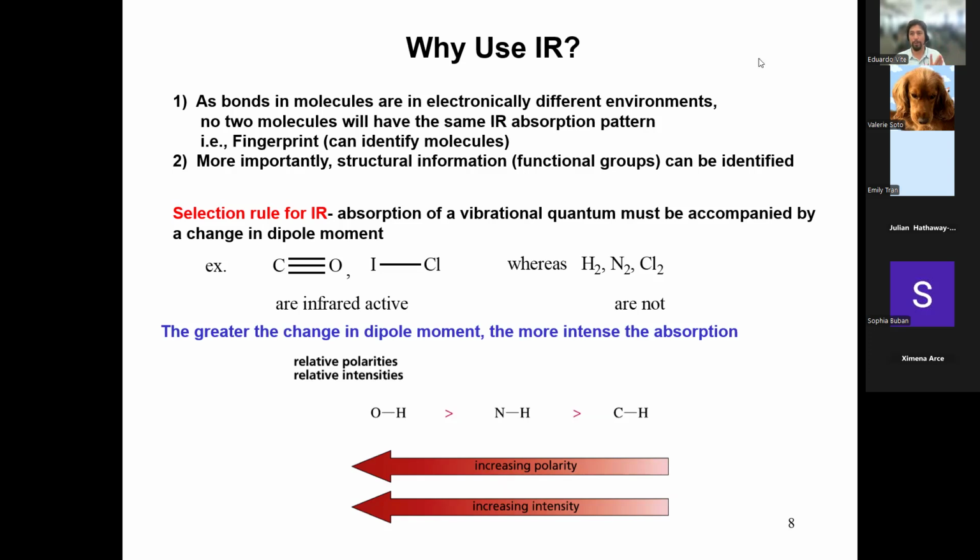And you've got to be careful because remember, IR depends on a change in the dipole. The polarity has to change when the bond is vibrating. If the bond vibrates but there is no change in polarity, for example, we learned about the diatomics in 111A and 111B: H2, N2, O2, F2, Br2, I2. Think about it. You have hydrogen and hydrogen, and if you vibrate them, there is no polarity difference. So there's not going to be any IR measurable bands. Same thing with nitrogen. Even though the bond is vibrating, there is no change in polarity, so you cannot see it on an IR spectrum.